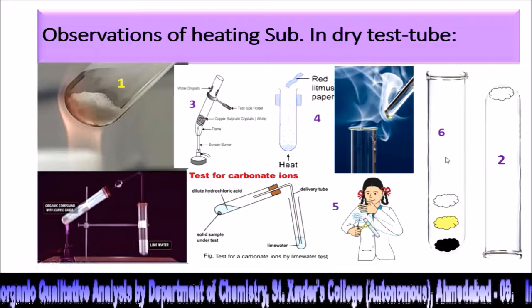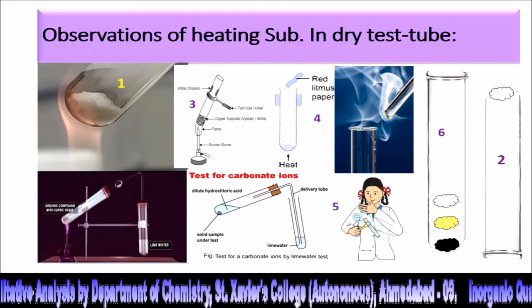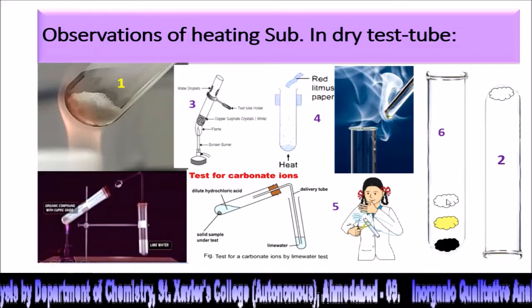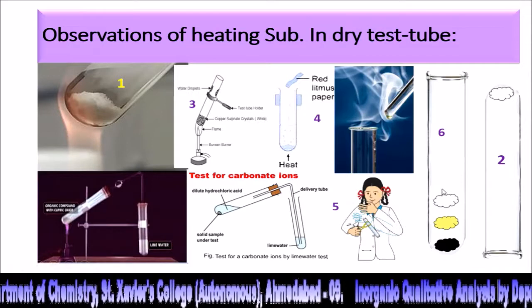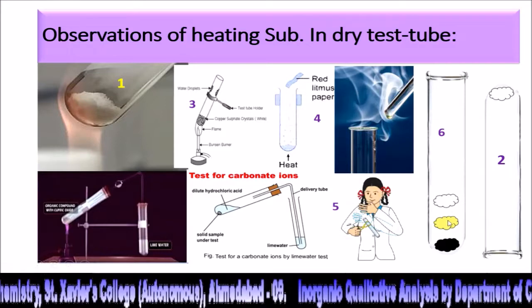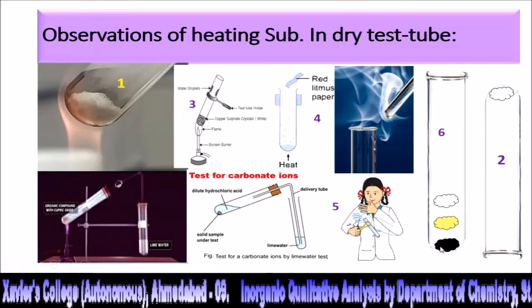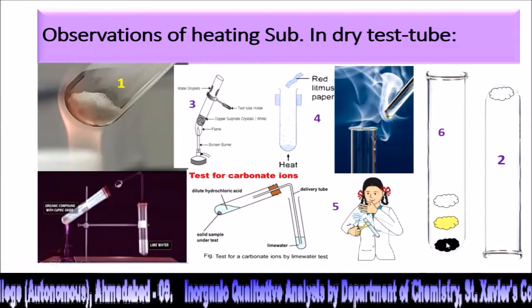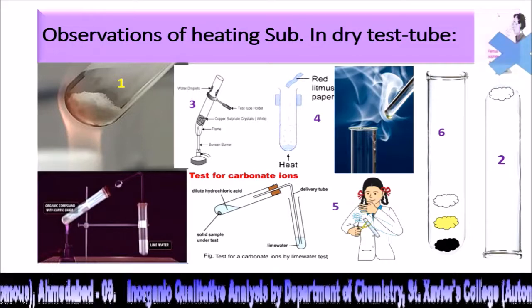And at the end, residue change. If the residue is colorless during hot and during cold, you can say calcium, strontium, barium, magnesium, aluminium, this kind of cation-containing salts would be there. If yellow during hot, and white during cold, then that would be zinc. And if the residue color is black, it would always be a colored element like iron, nickel, chromium, manganese, etc.